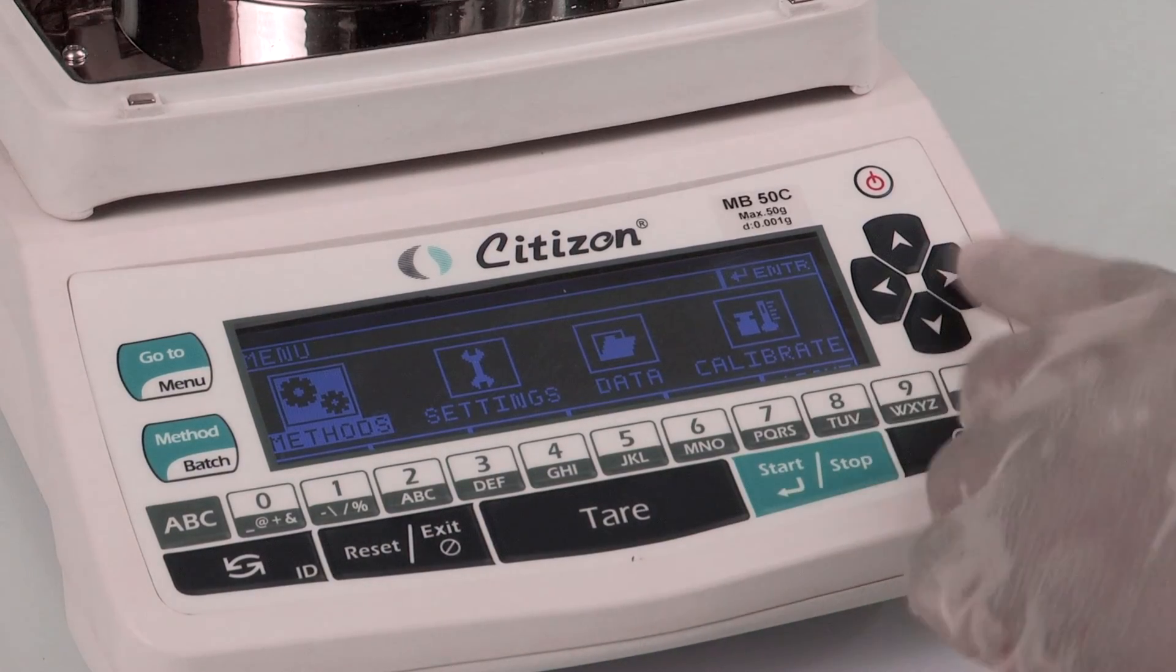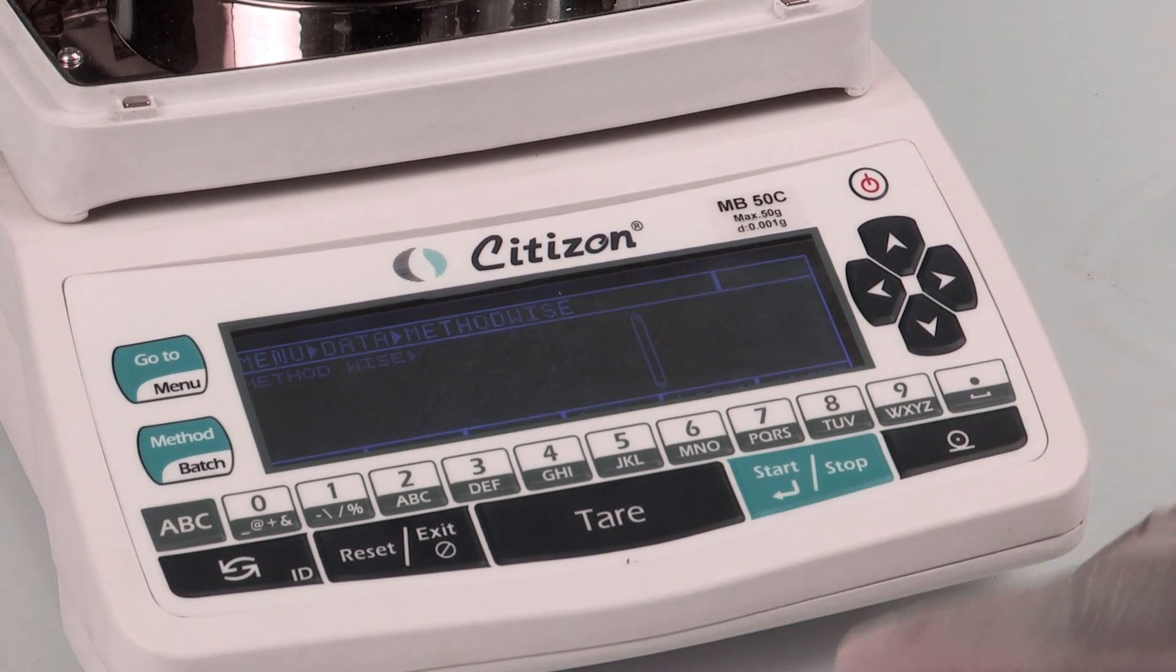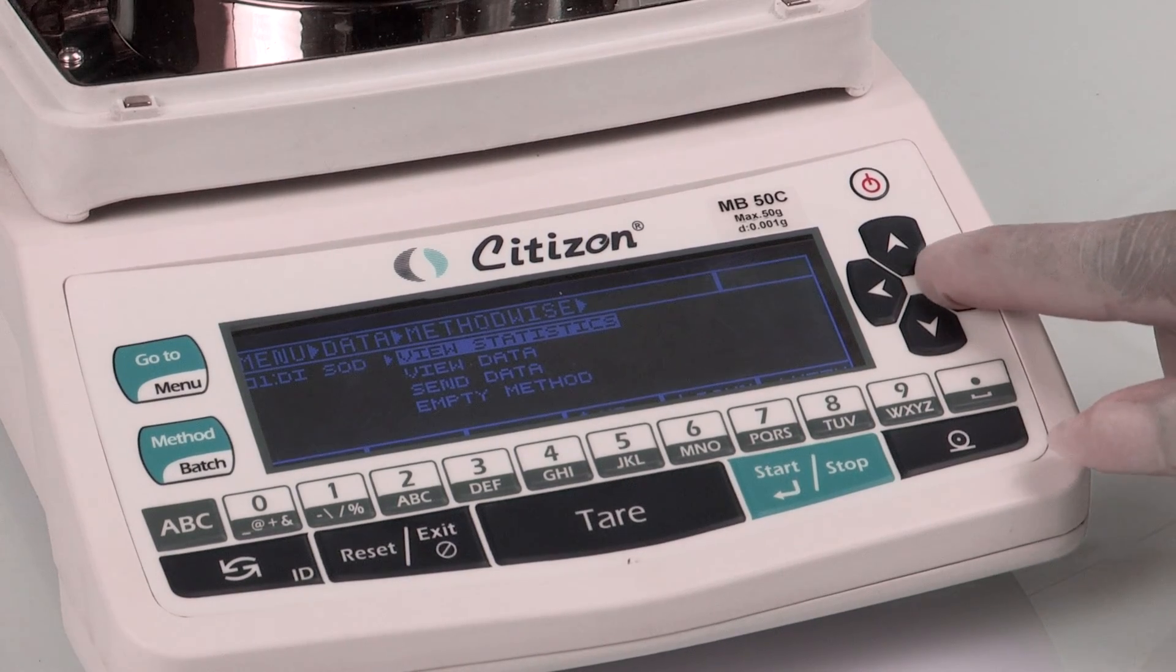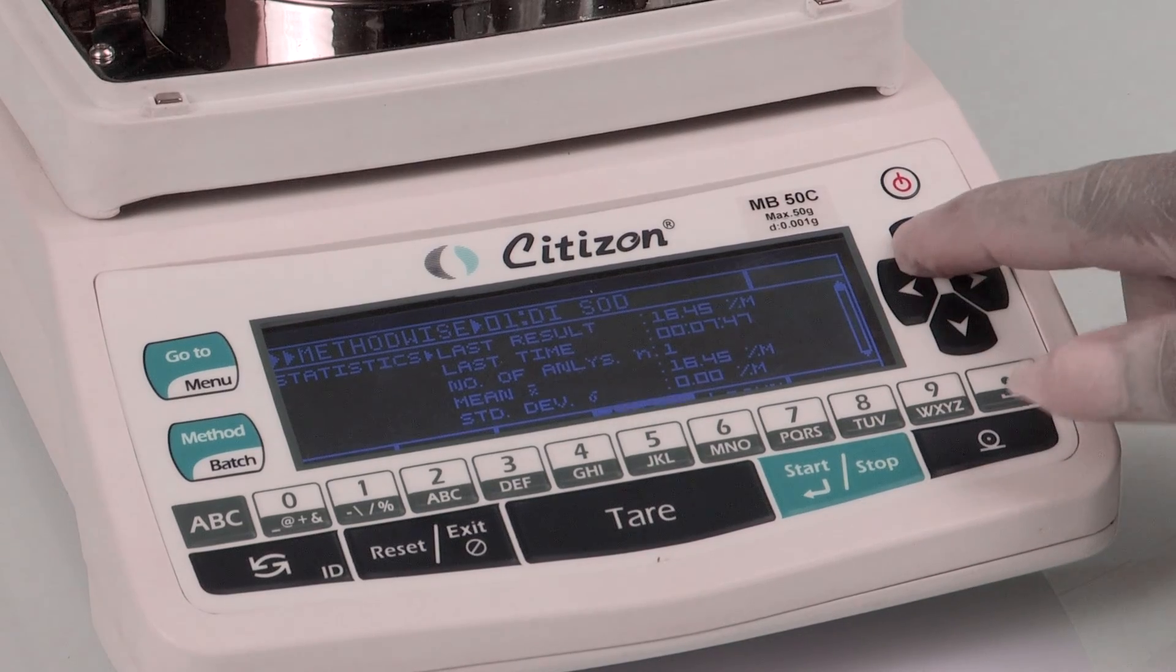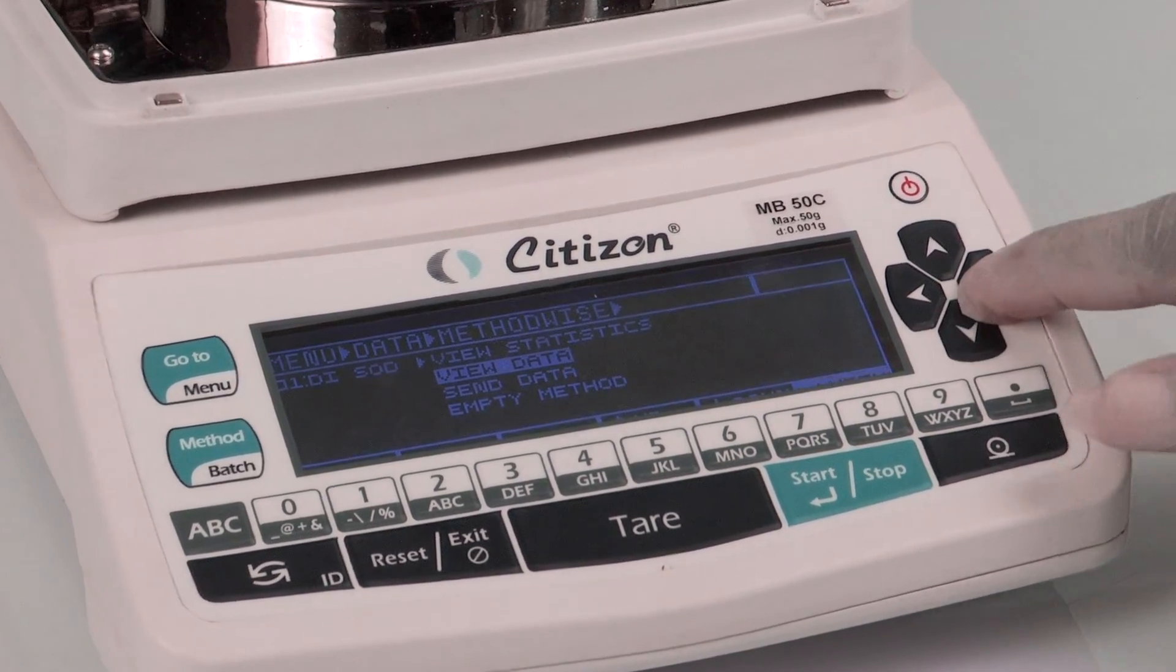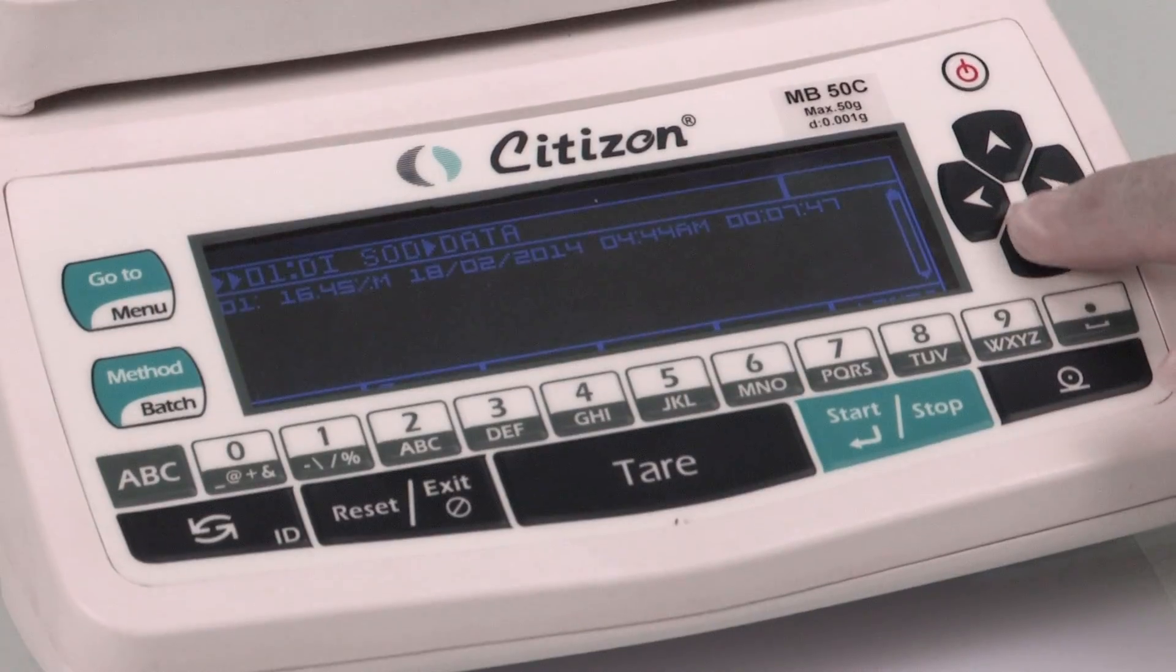Storage capacity of thousand parameters in the form of methods or batches extends flexibility to the operator. It offers the feature of statistics with the capability to display and print previous 9,999 measurements based on each method or batch. This proved to be handy for research-related tasks.